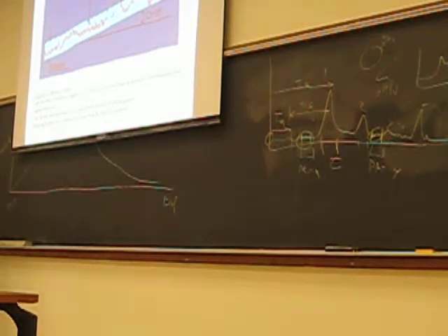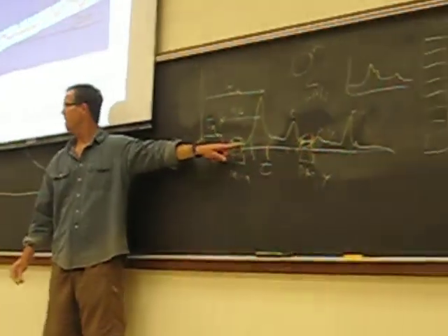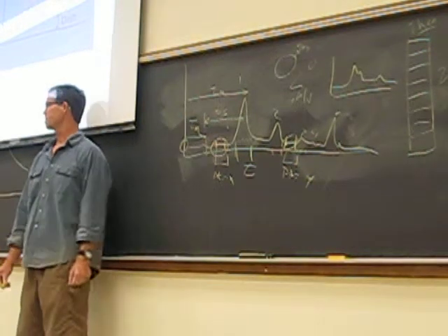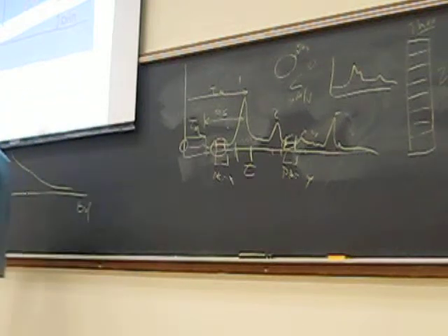First, what you're describing, are you just picking random spots to integrate that would seem to be just flat? Yes, where there's no peak. So you need to pick an area that you are confident is baseline. You might want to go into that chromatogram and expand the y-axis substantially to make sure there's nothing there, no surprises, just baseline noise. Then you integrate over an area of similar duration to where your peaks elute. You have to integrate over the same width for each of them.